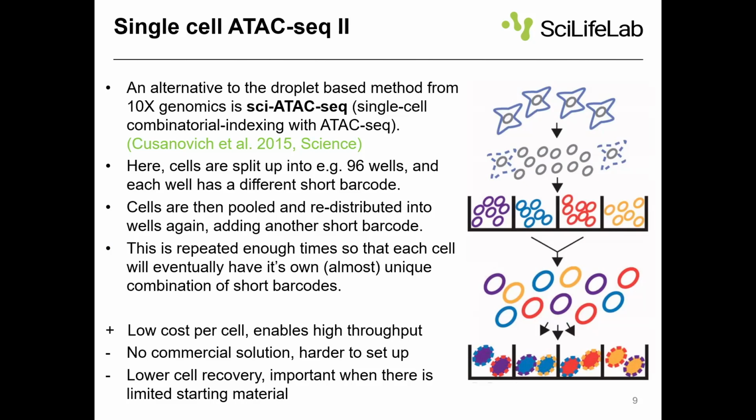As far as I know, there are no commercial kits available for this, but if you're a big and ambitious lab and have some resources, you can make this work. And the good thing is that, if you have a big project, this becomes very cheap per cell, so you get a lot of data out. Of course, you lose a lot of cells along the way, so you shouldn't do this with some very precious, limited starting material.